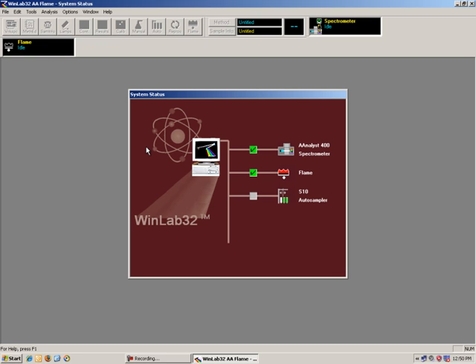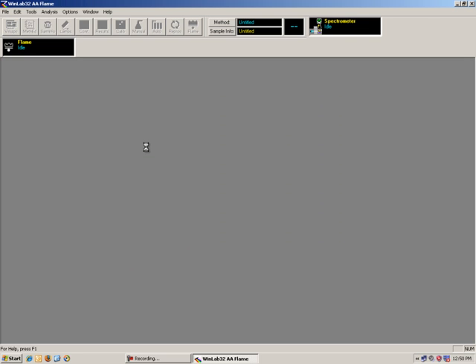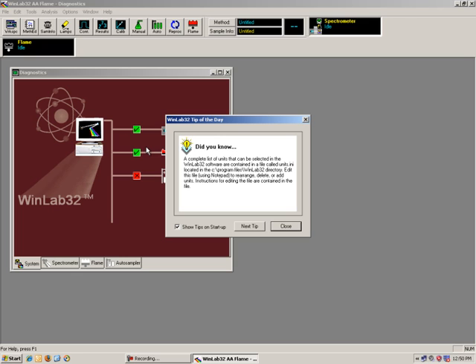If that occurs, it means that the waste container that collects large drops that didn't make it through the nebulizer has a U-tube in it, and that U-tube is full of water, and that prevents it from being open to the air. There's an electrical switch in that tube, and if that U-tube is not full of water, that electrical switch won't be connected, and you'll get this error message. If that happens, take a squirt bottle. There's a small hole in the top of the waste container, and you need to fill that up with water until that interlock goes away.